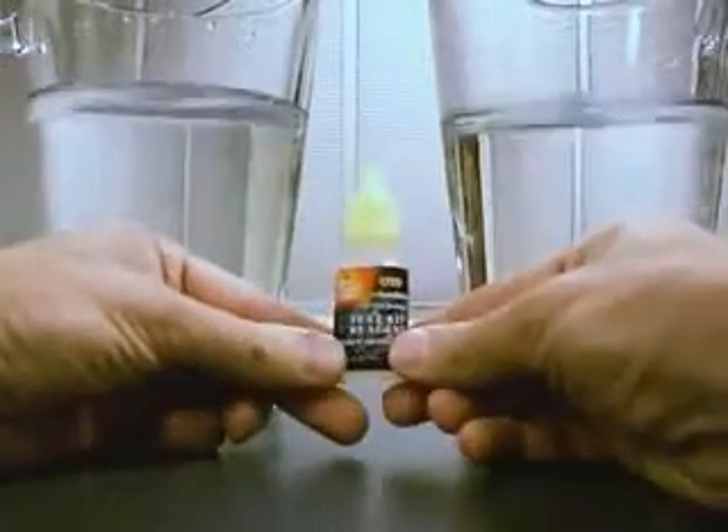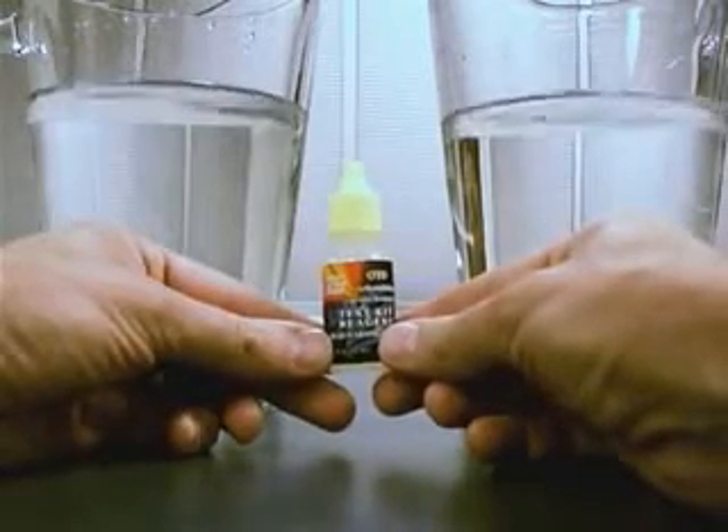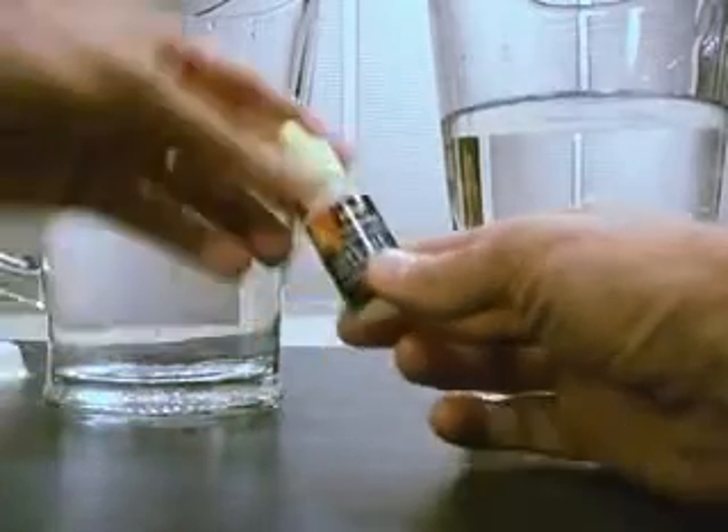This is a chemical called OTO, a very common testing chemical used for swimming pools to detect the presence of chlorine. When chlorine is present in the water, this will turn the water yellow or orange.